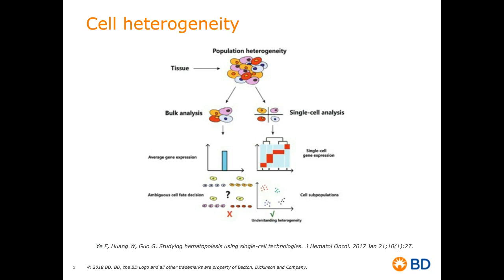And today, we will focus on two single-cell analyses, flow cytometry and single-cell RNA sequencing. How can they be used individually to address cell heterogeneity, but most importantly, how can the integration of both take us to a further level of characterization of cell heterogeneity.